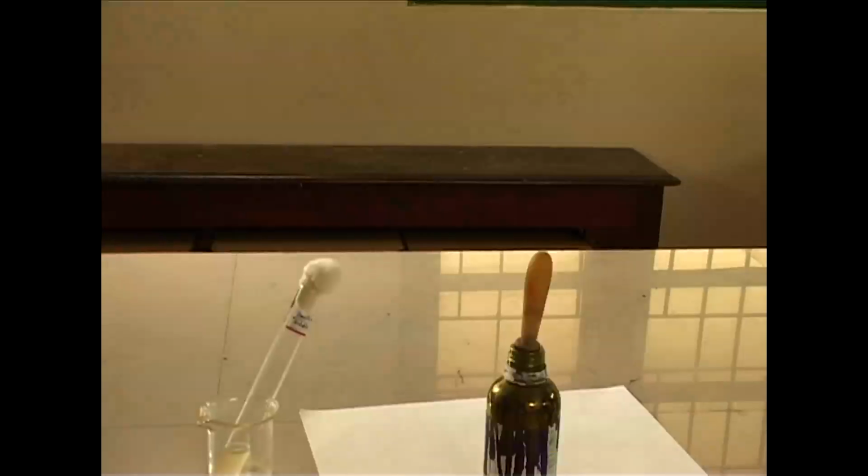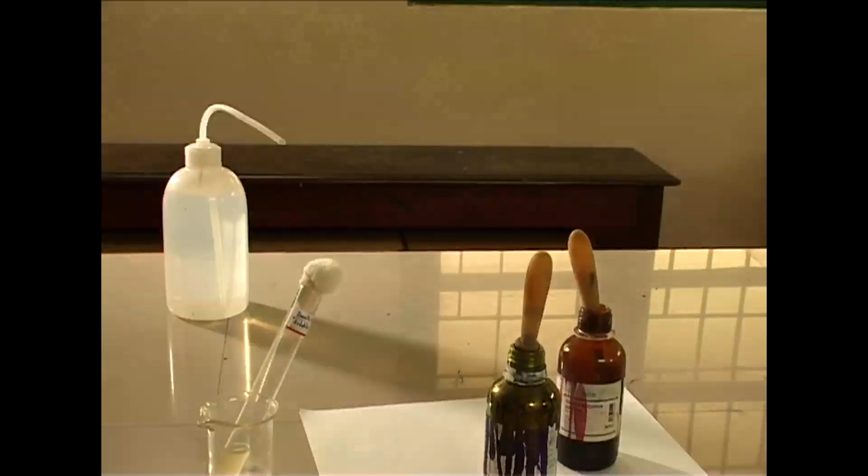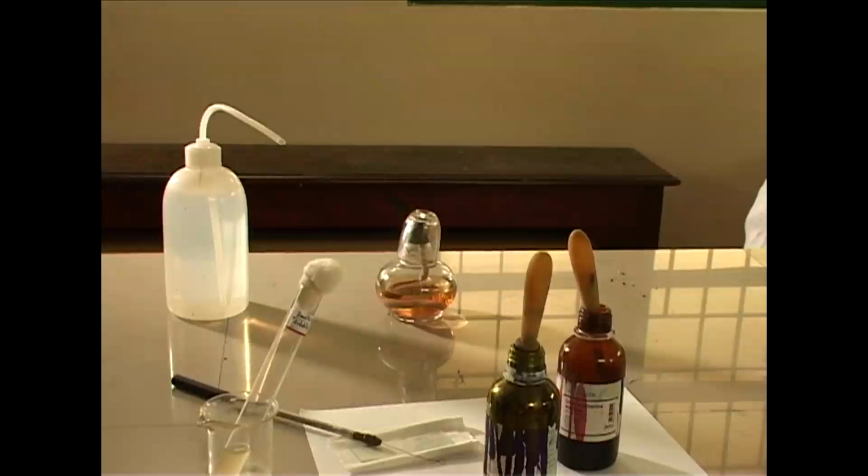We require Bacillus cereus or Bacillus subtilis culture containing endospores. We require the staining reagents such as malachite green, safranin and distilled water. What else? We require clean, grease-free glass slides, inoculating loop, spirit lamp, blotting paper, and microscope.